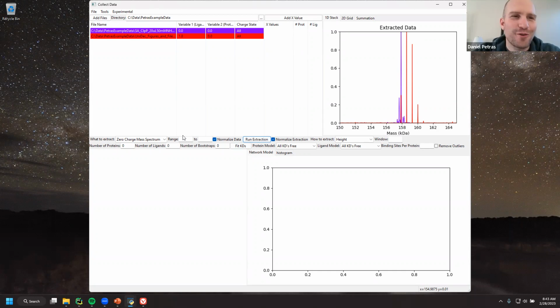Yeah. There's of course another way that we would do it. That's to export the spectra as SVG and throw it into Illustrator. So is there a way to get an SVG out of UniDec?